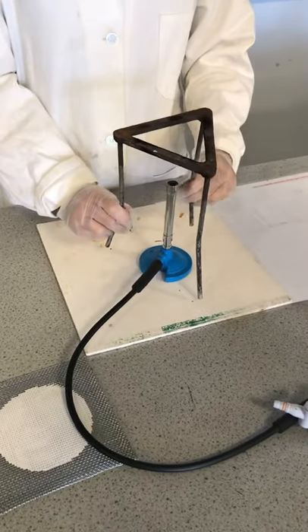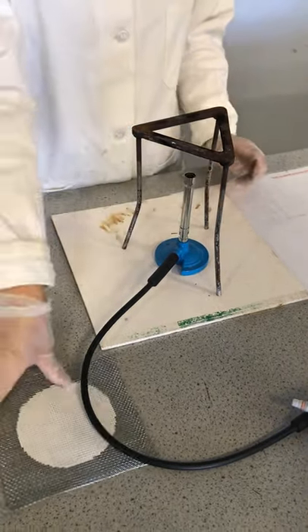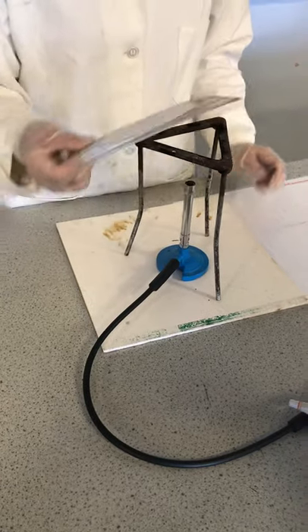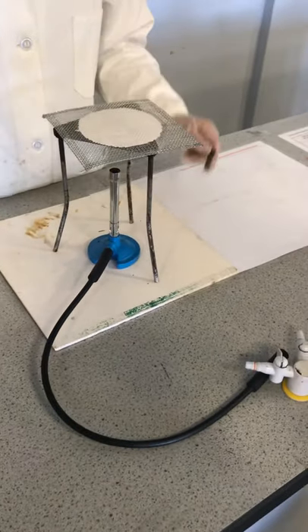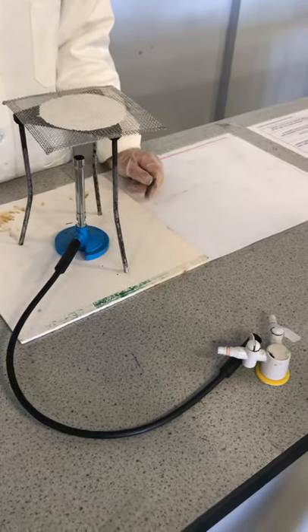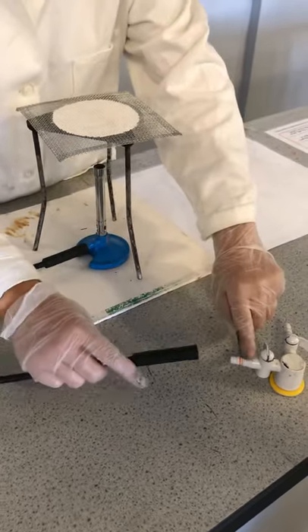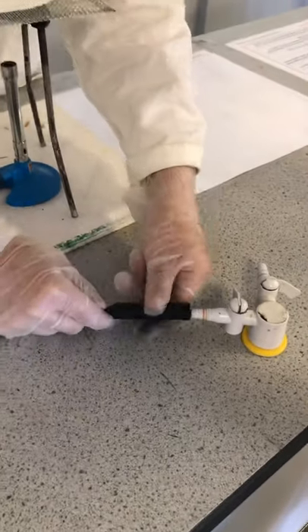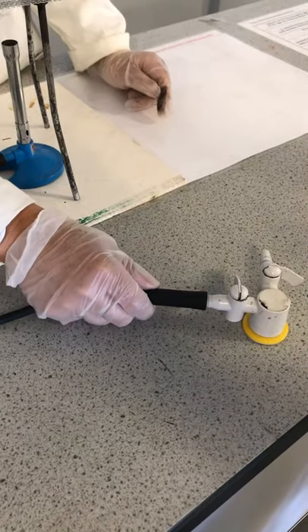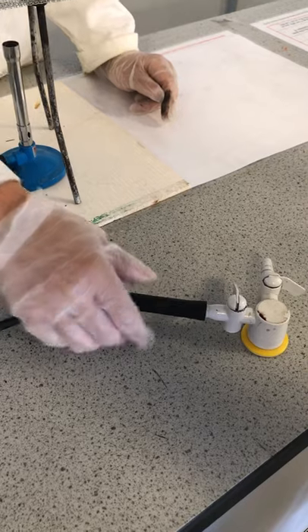Place the ceramic gauze on top of the tripod. Now we will connect the rubber tubing attached to the Bunsen burner to the gas tap. Make sure it is firmly connected and not loose.